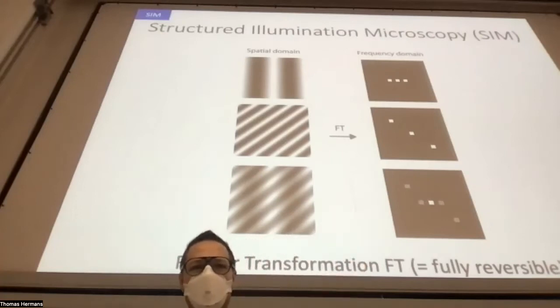Okay, so structured illumination is kind of the hardest one to explain, so I'll try to go slow.